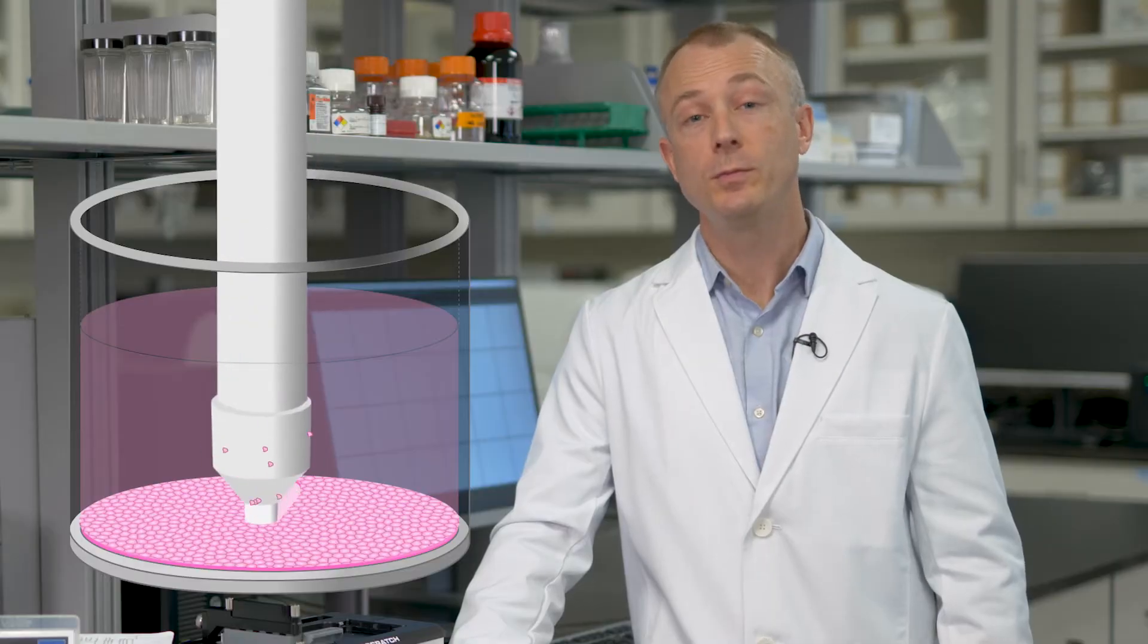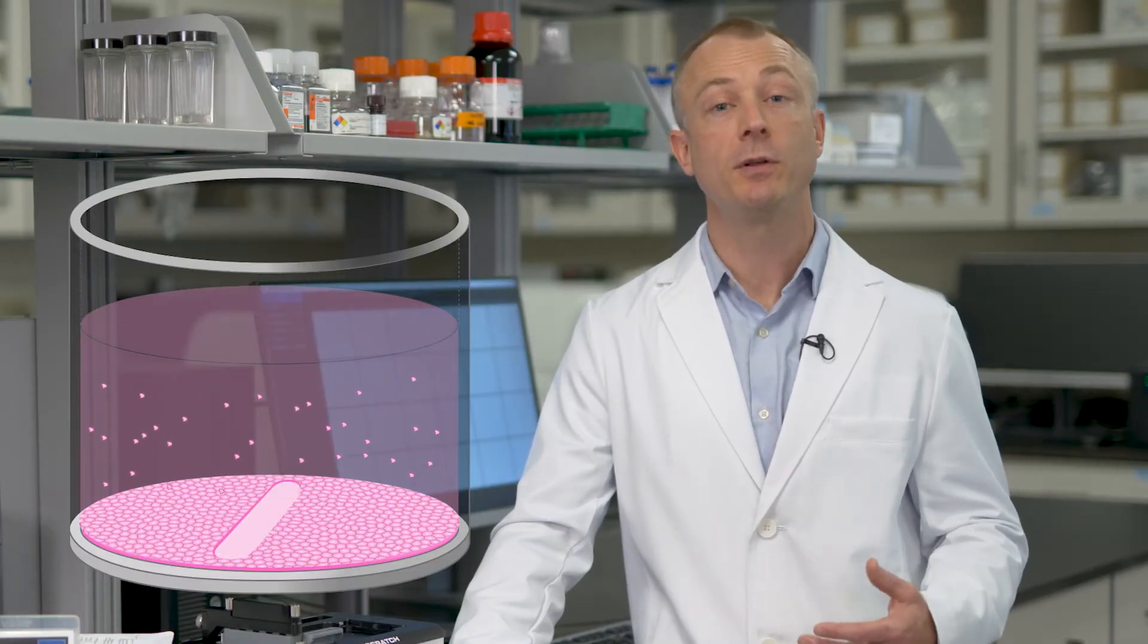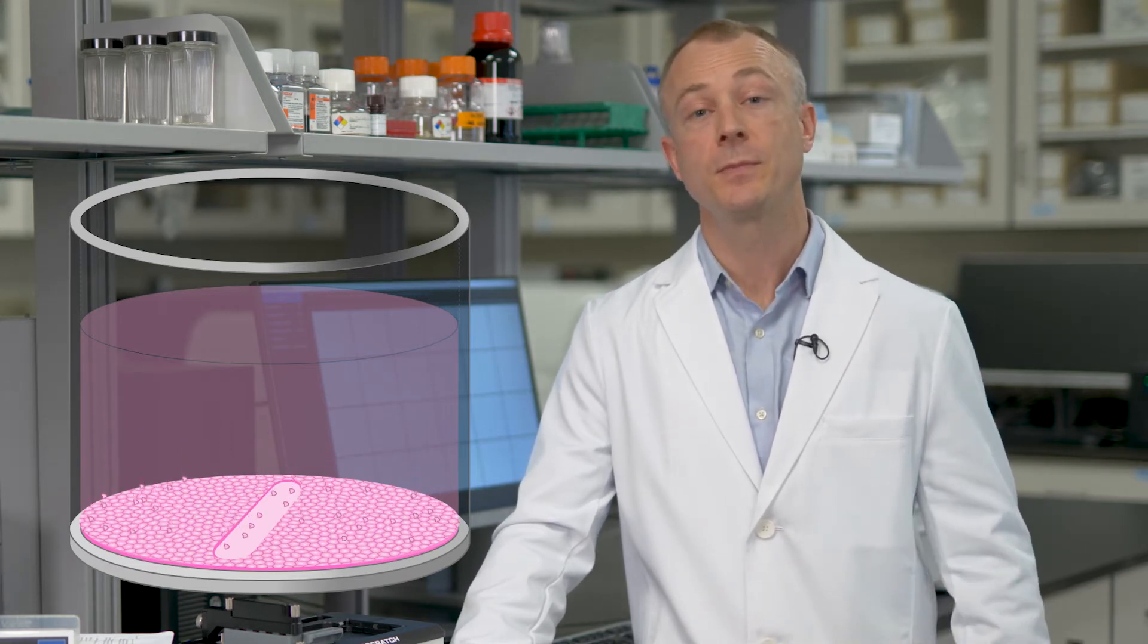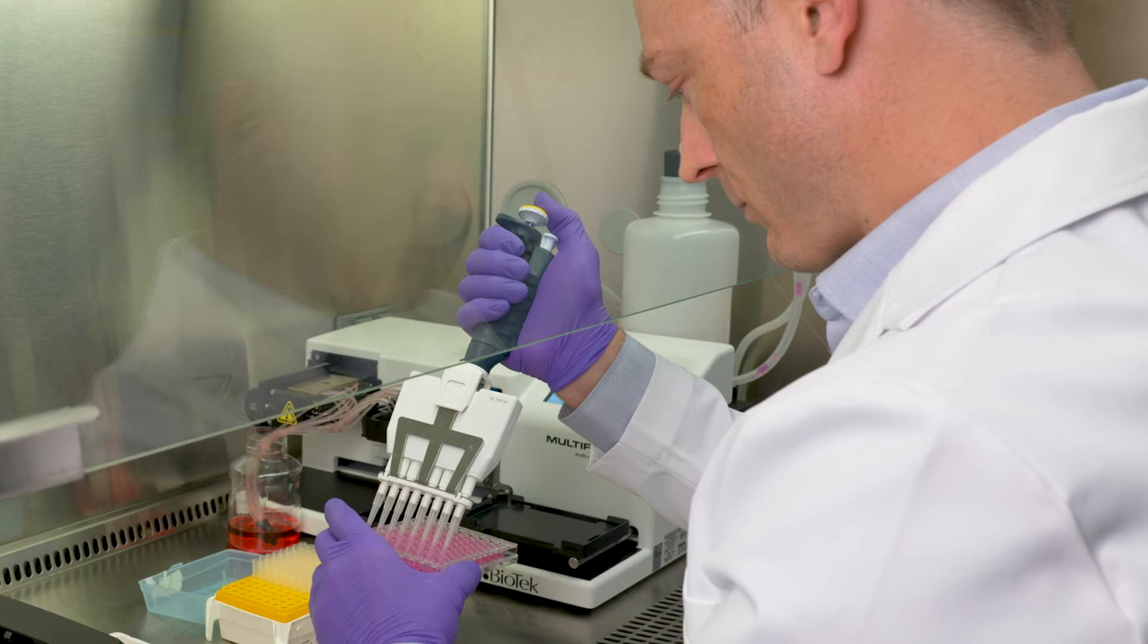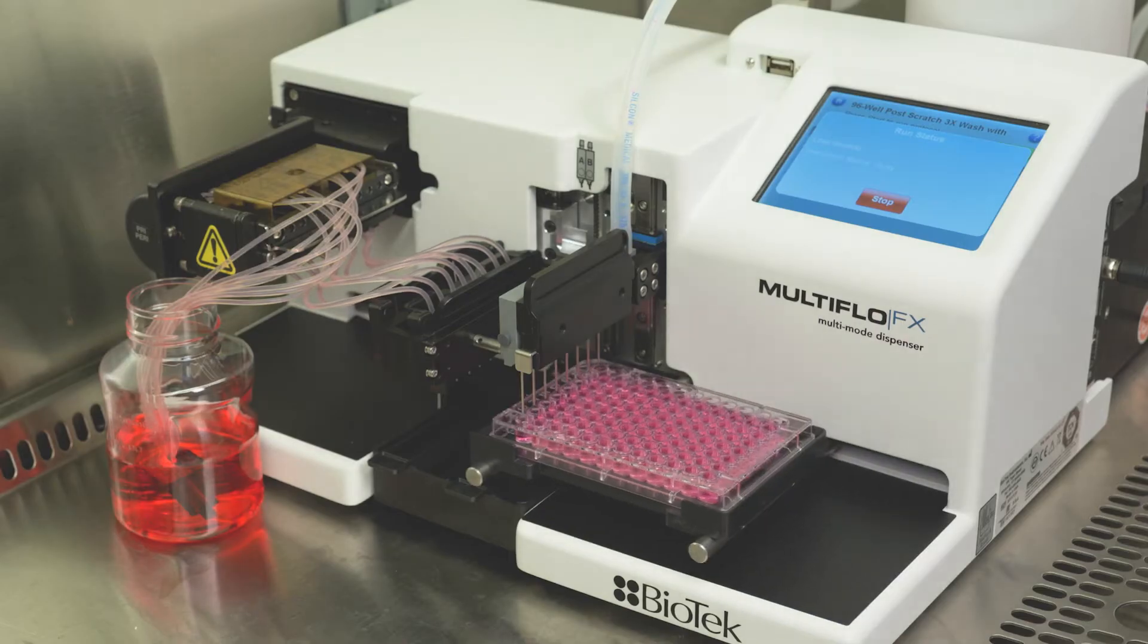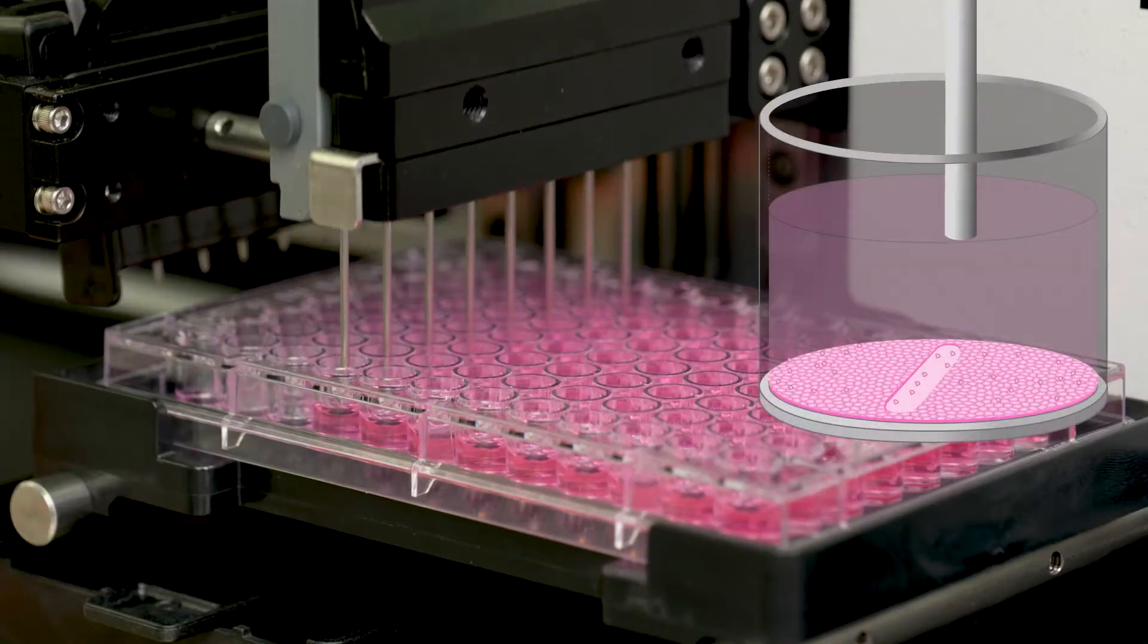After wounds are formed, it's critical to remove cellular debris generated during this process to prevent it from settling back down into the wound area. This can be done with a series of manual wash steps. However, for the fastest, most effective results, we developed an automated protocol using the MultiFlow FX.